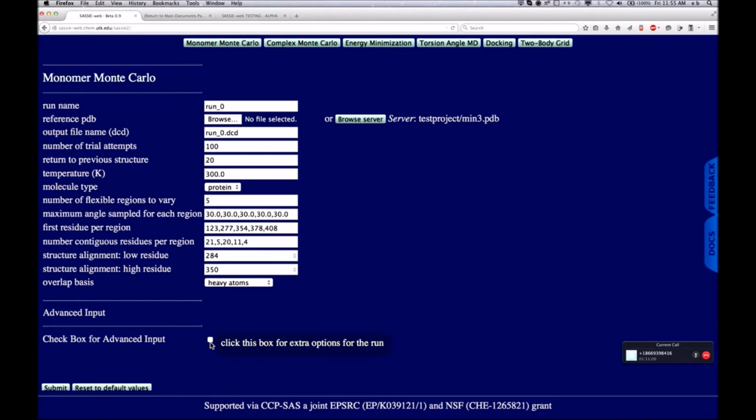So the basic idea, at least in the small angle scattering field, is that the majority of these computations are: I have a set of inputs, I produce a set of outputs. So there, it's the module developer's responsibility to read and write valid JSON.